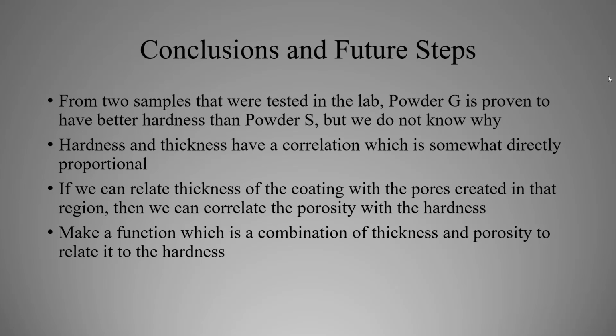In conclusion, we see that from the two samples that were tested in the lab, powder G is proven to have better hardness than powder S, but we do not know why. Hardness and thickness have a correlation which is somewhat directly proportional.